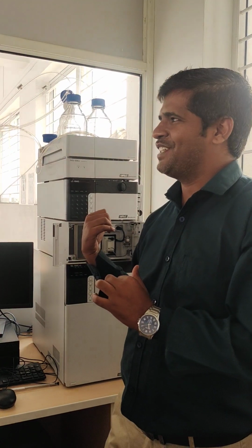One more concept of the gradient system is that we can change the composition, the concentration, of the mobile phase during the analysis. That is called the gradient system, or gradient elution. So what is the application of the isocratic system and of the gradient system? We have to know it, na? Only then can we use the gradient system here.